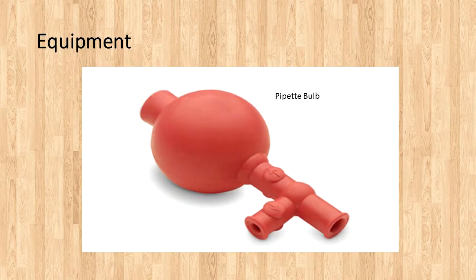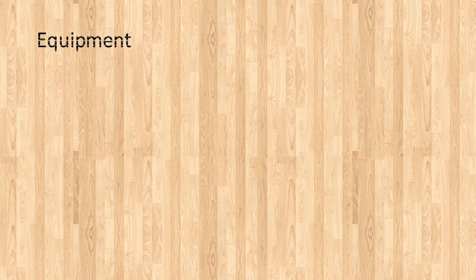4. Three-way pipette filler or pipette valve is used for pipetting. The attachment is placed over the mouth of the pipette. Squeeze the air valve A and the bulb simultaneously to empty the bulb of air. Gradually squeeze the suction valve S to draw liquid into the pipette, and squeeze the valve E to withdraw liquid out of the pipette.